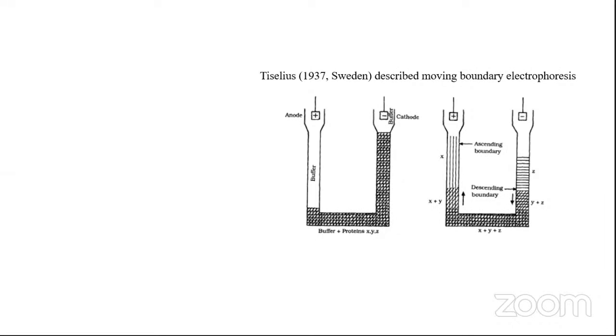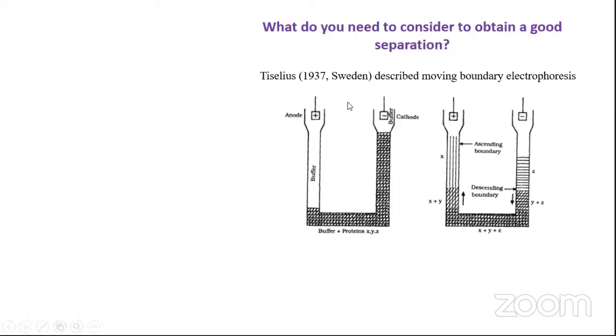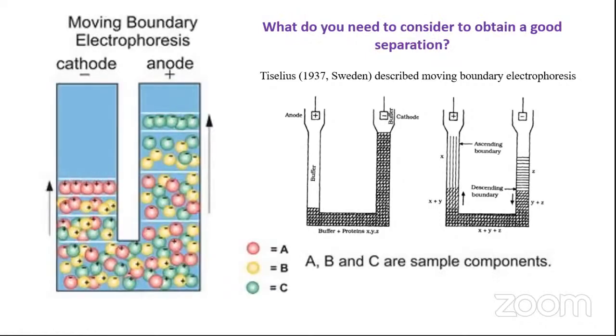We discussed how the situation can get complicated when using this kind of apparatus, and what points should be considered. We talked about three different component molecules present in your sample mix.